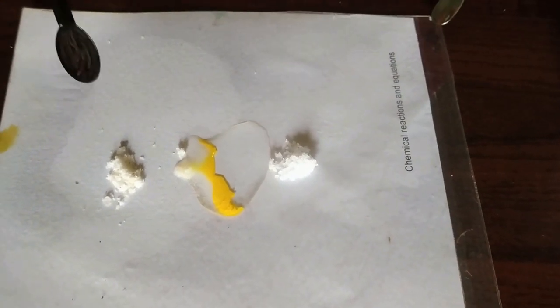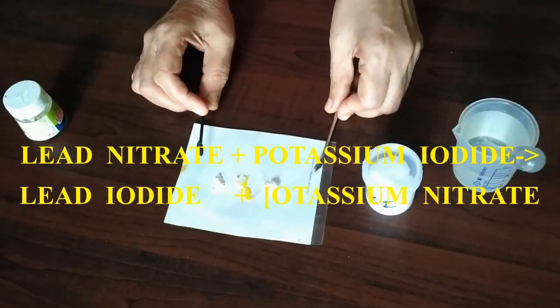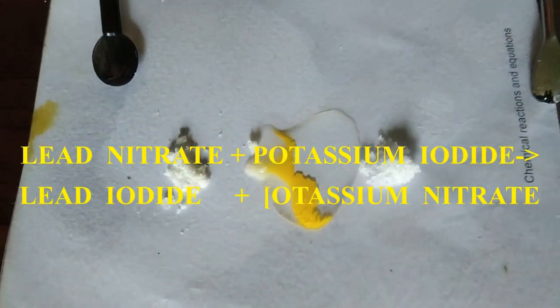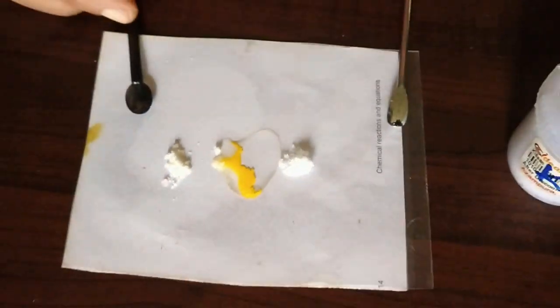So this experiment can not only be used to explain double displacement, you can also tell them about diffusion and which is heavier, which is lighter, and heavier ions move slowly. So if you do the same experiment in test tube, you will get a whole lot of yellow color precipitation, but not this way a line formed.